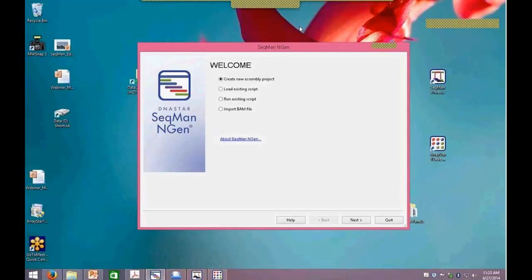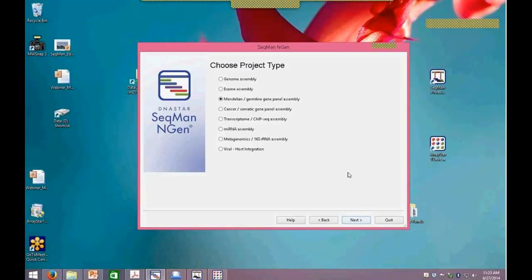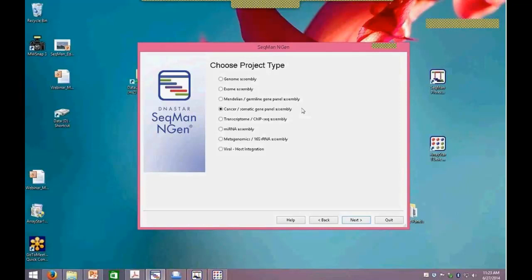Once you have the assembly run, you can do the analysis in ArrayStar or SeqMan Pro on your regular laptop or desktop computer. We start by creating a new assembly project. For those familiar with the software, you can see we have a couple of new workflows. We distinguish between a Mendelian and a cancer or somatic gene panel assembly. The difference is primarily in the SNP calling — we're expecting SNPs in different ratios, and it sets different defaults depending on the expectation with the variants observed.